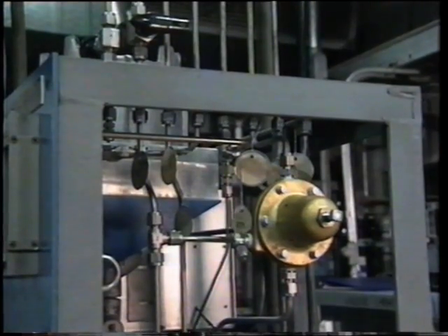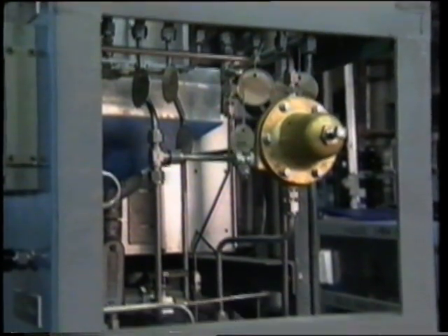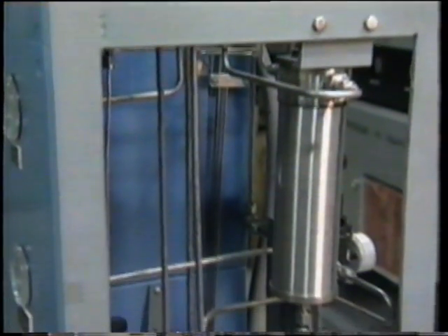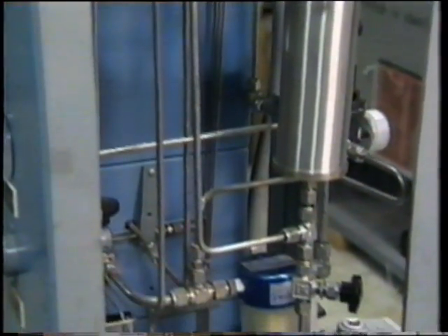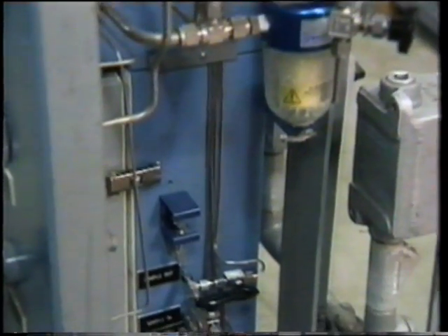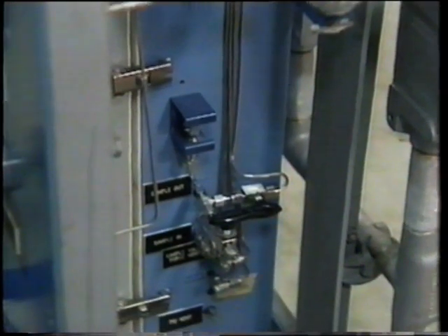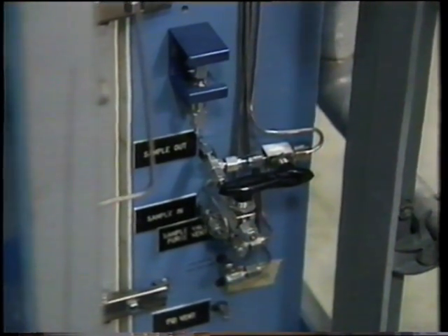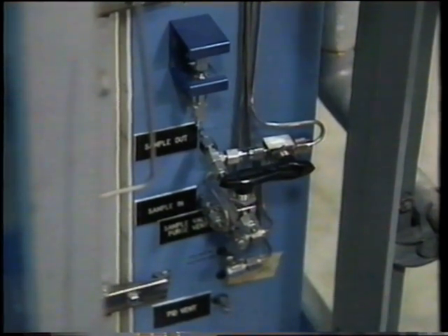Be aware that each sample system is unique, since each process requires specific forms of sample preparation. Consequently, the configuration and maintenance of the sample systems may vary. In the next segment, we'll be looking at gas chromatograph valve maintenance. Your workbook contains additional information on sample handling maintenance.